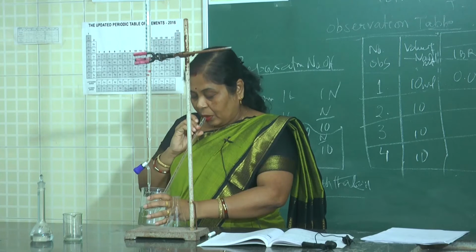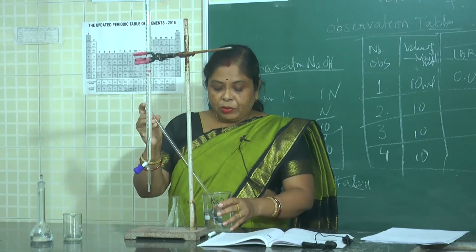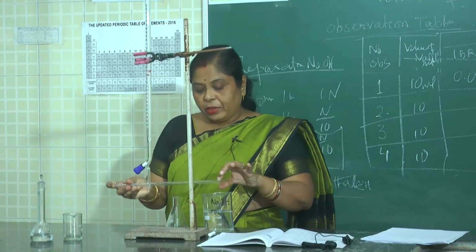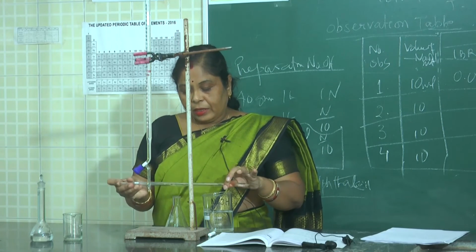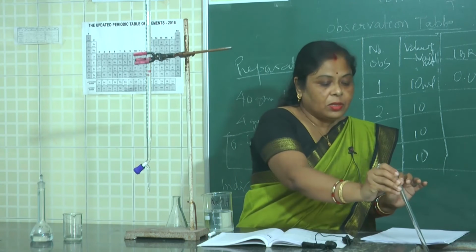So for rinsing, I have to take some amount of solution. Then again the same way you roll it like a burette and drain it. If it is a dry one, you can directly take the solution.